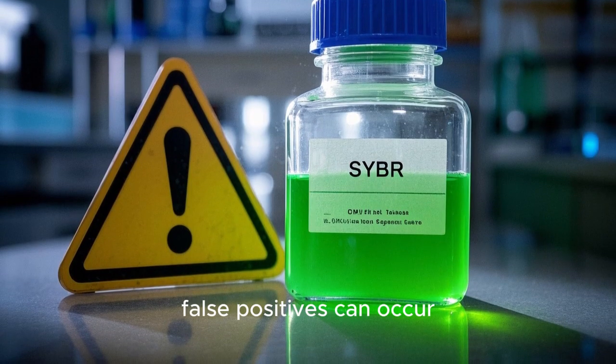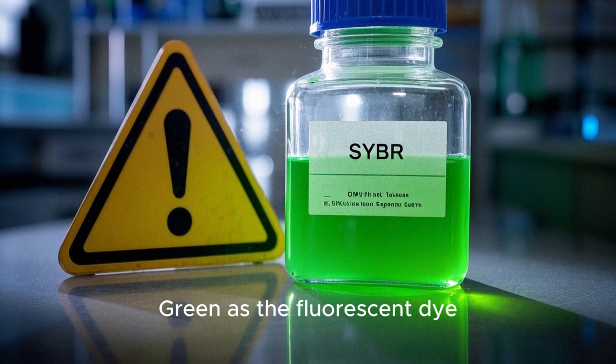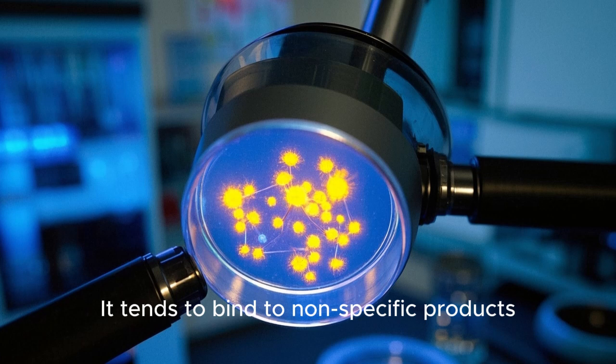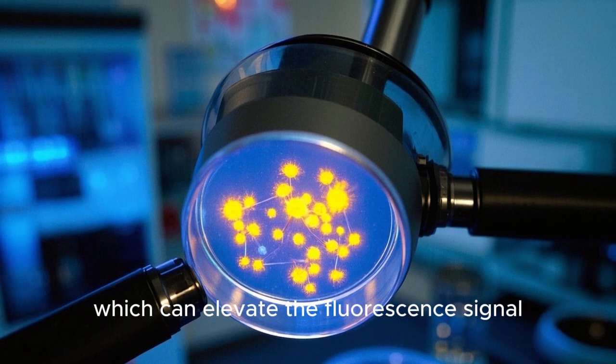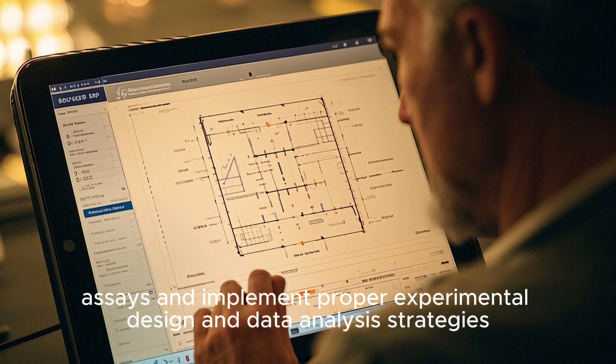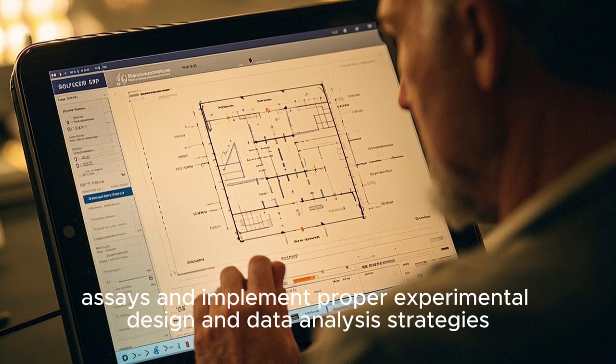Additionally, false positives can occur, especially when using SYBR green as the fluorescent dye. It tends to bind to non-specific products, which can elevate the fluorescent signal. To mitigate these challenges, it's essential to use validated assays and implement proper experimental design and data analysis strategies.